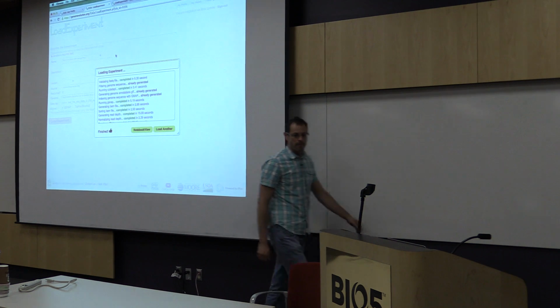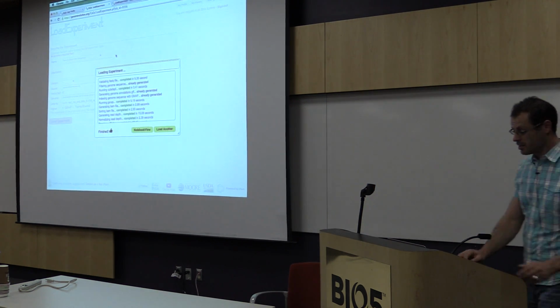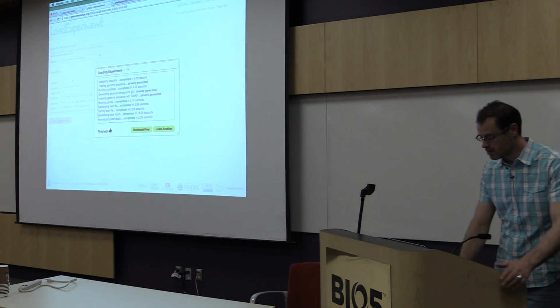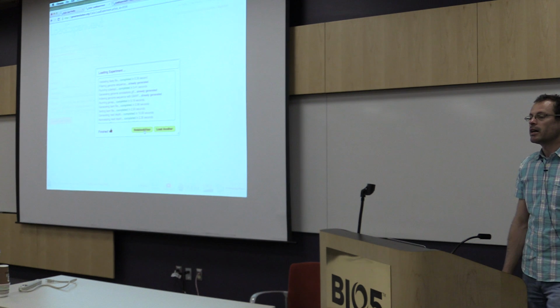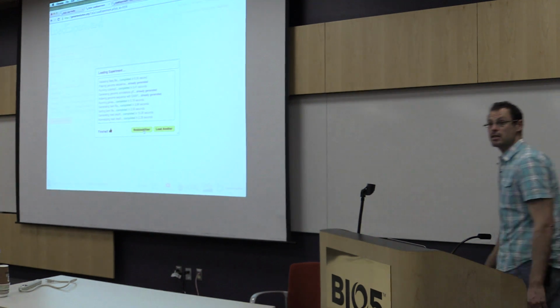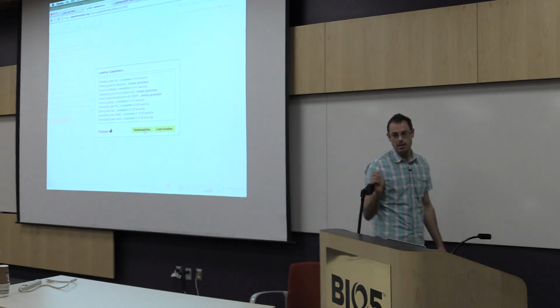I have no idea what's going on. But we'll continue and just pretend for the moment that things worked. And we'll get them up to the dev team to see what's going on. So what it's done behind the scenes is it has run an RNA-seq processing workflow.